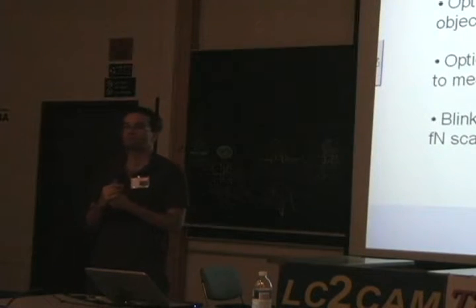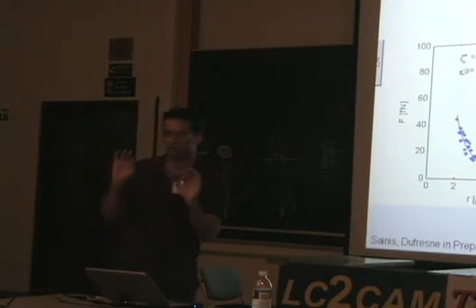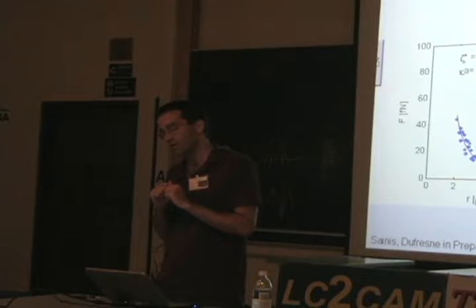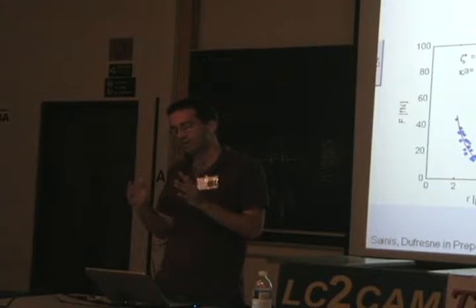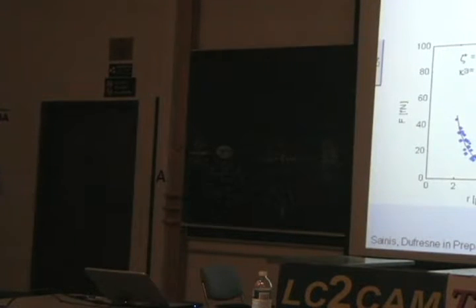More questions? So you briefly showed that the force that a particle is feeling is a function of its refractive index. What's the wavelength dependence of force? Yeah, so I didn't get into too much detail. The way I described it is I said that the force was proportional to the index. But typically you have different materials competing to be in the focus. So if I have a glass particle in water, both the water and the glass particle want to be in the focus. So what's really important is the index of refraction mismatch that determines who's going to win.